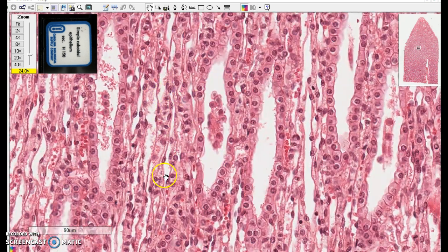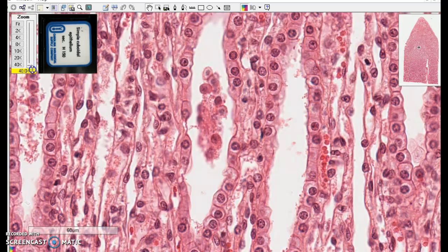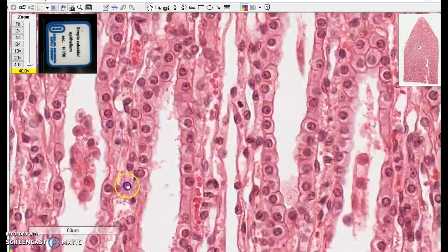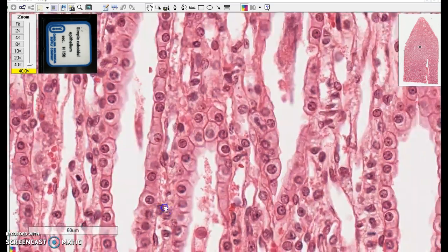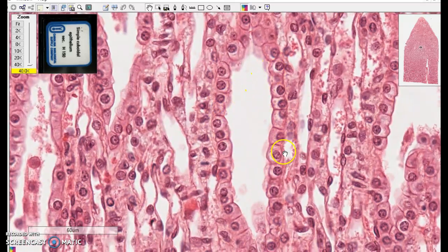These are single layers of simple cuboidal cells and we're going to go all the way up so we can get a good look at these and find a nice spot. Oh I like that one.